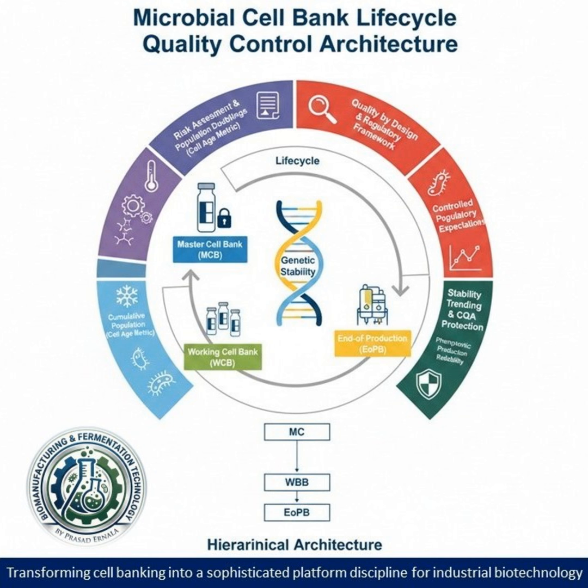Well, how? To place that on a little vial sitting at minus 130 degrees Celsius. It's the ultimate constraint. And it's exactly why the architecture is so rigid. You can't just have one big bank. You need a hierarchy, a system that separates the regulatory anchor from the day-to-day operational supply.